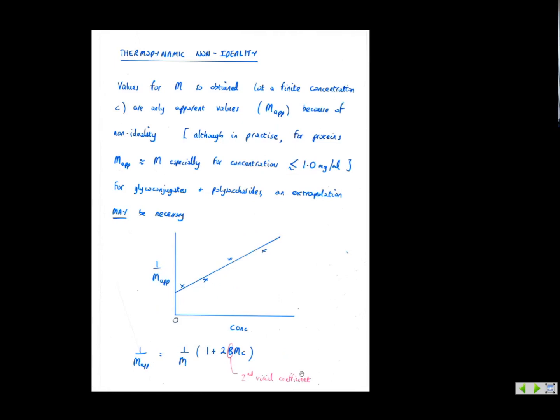Okay, there's one final thing to be aware of when measuring molecular weights by sedimentation equilibrium in the analytical ultracentrifuge.